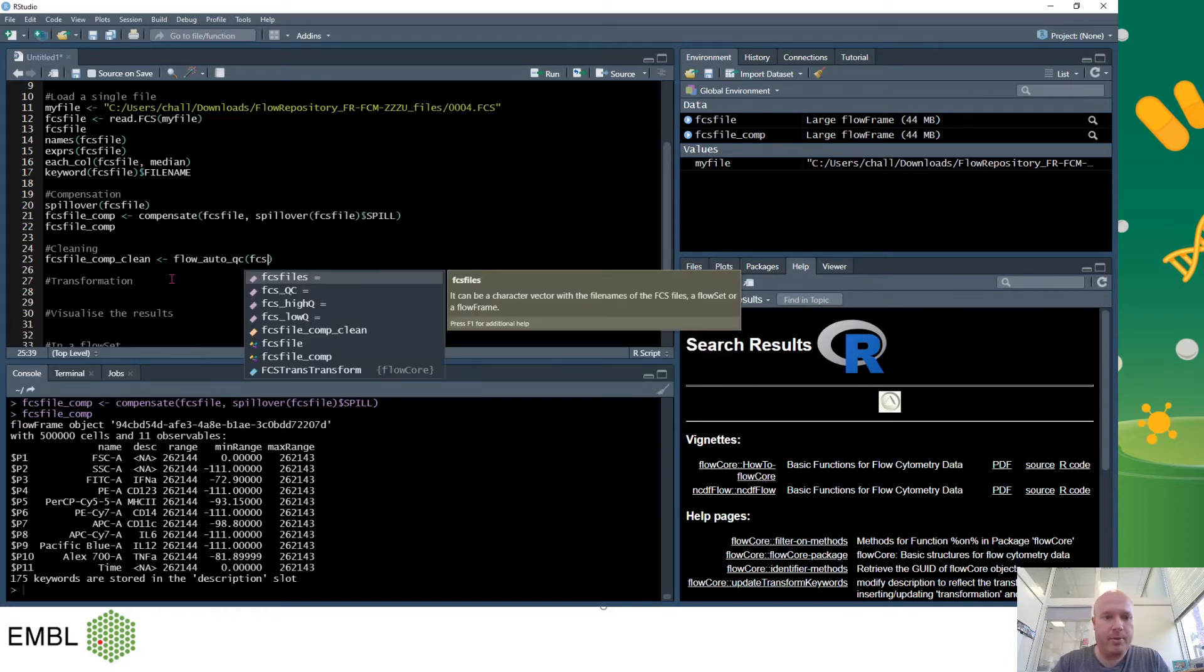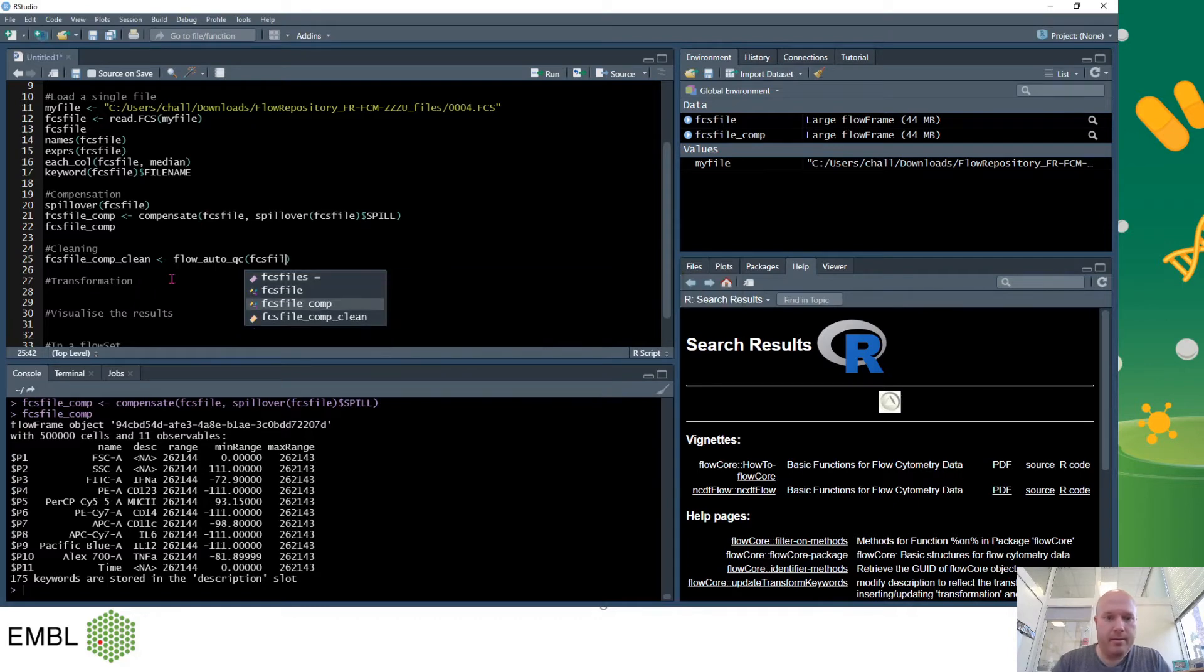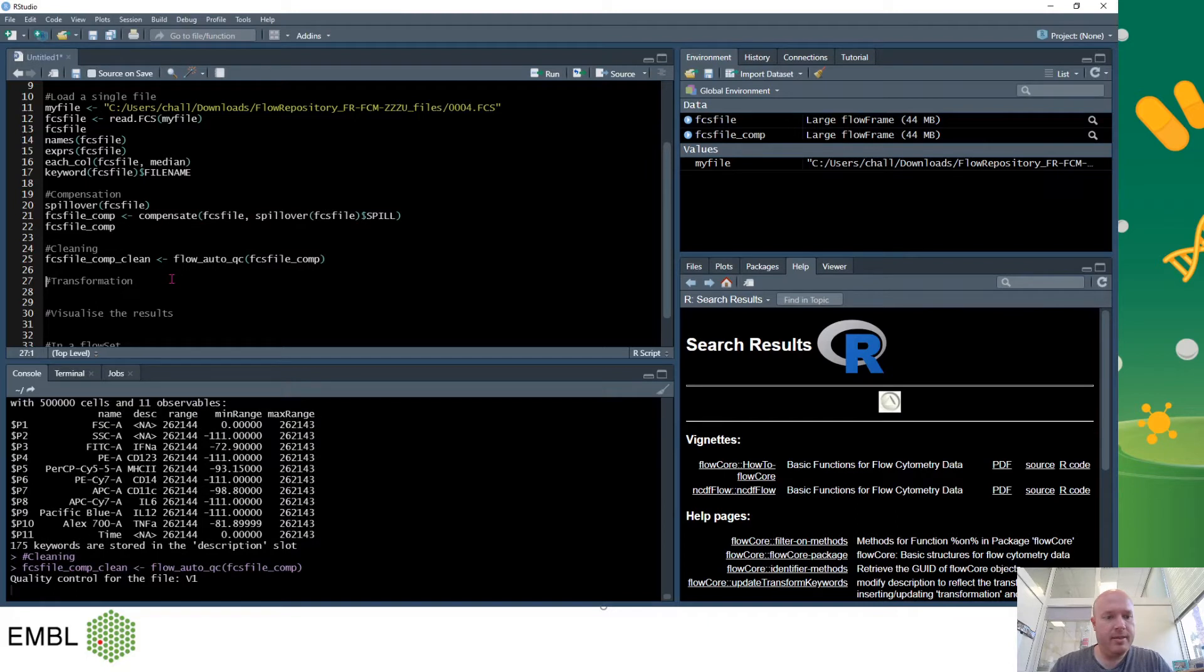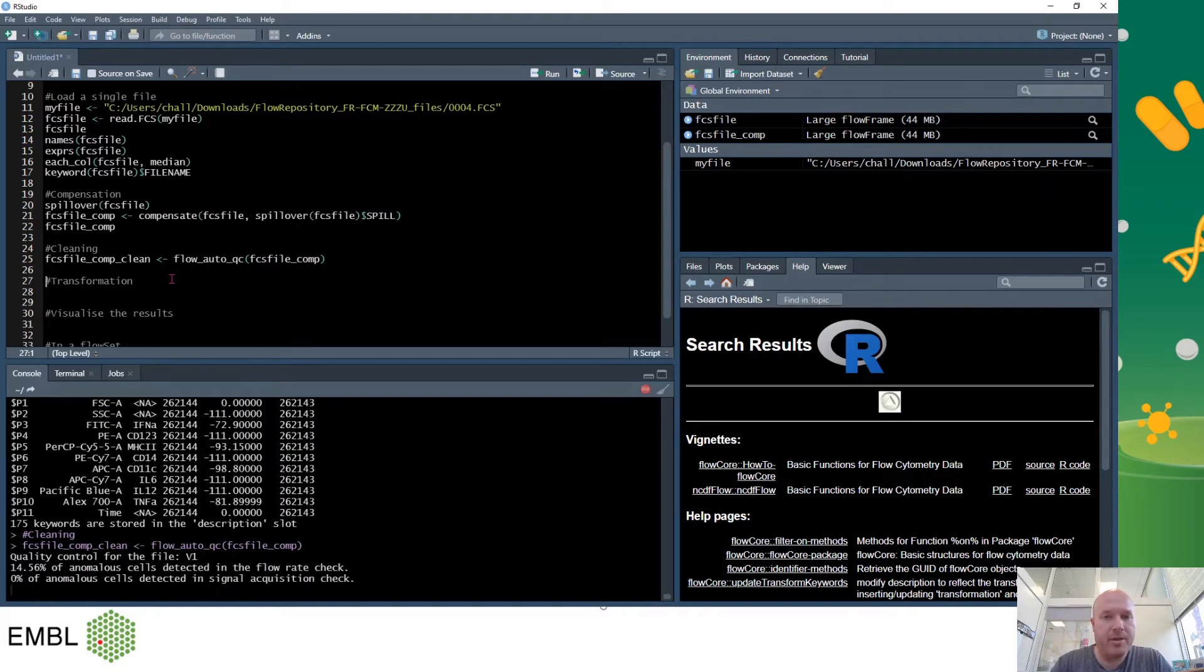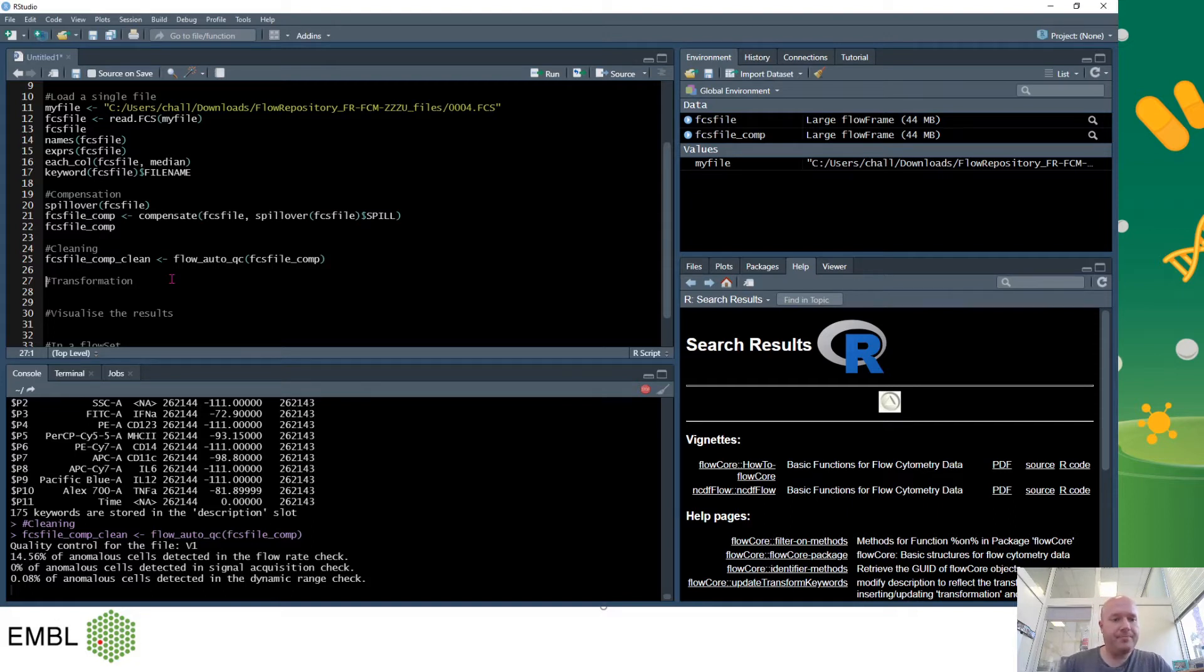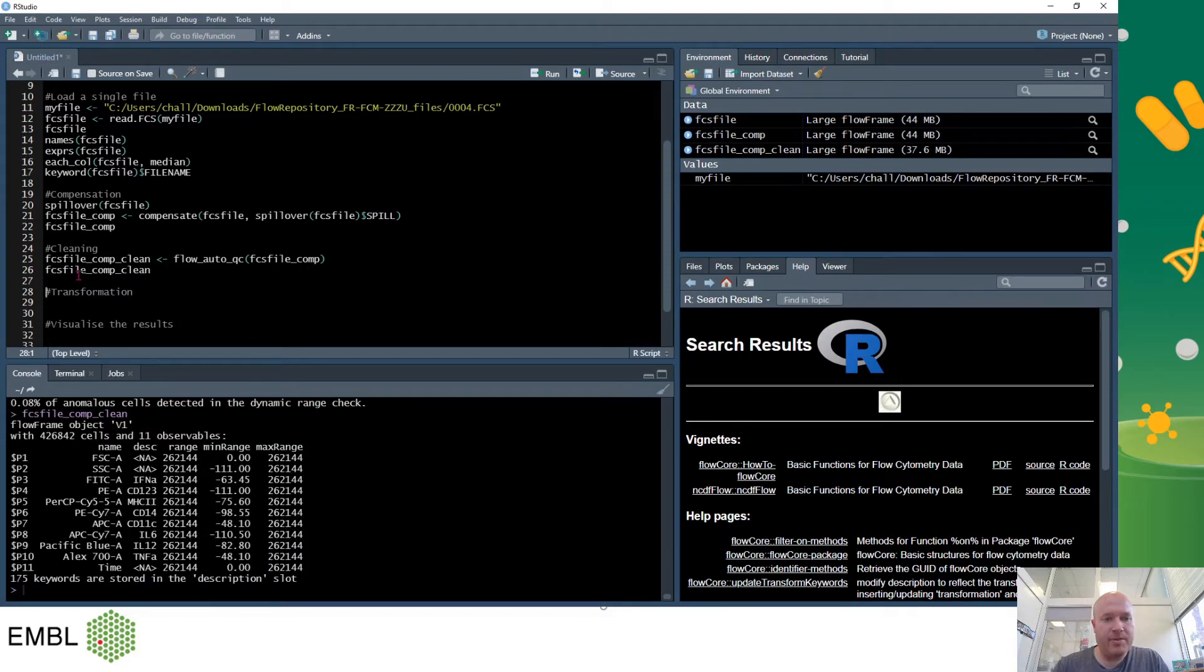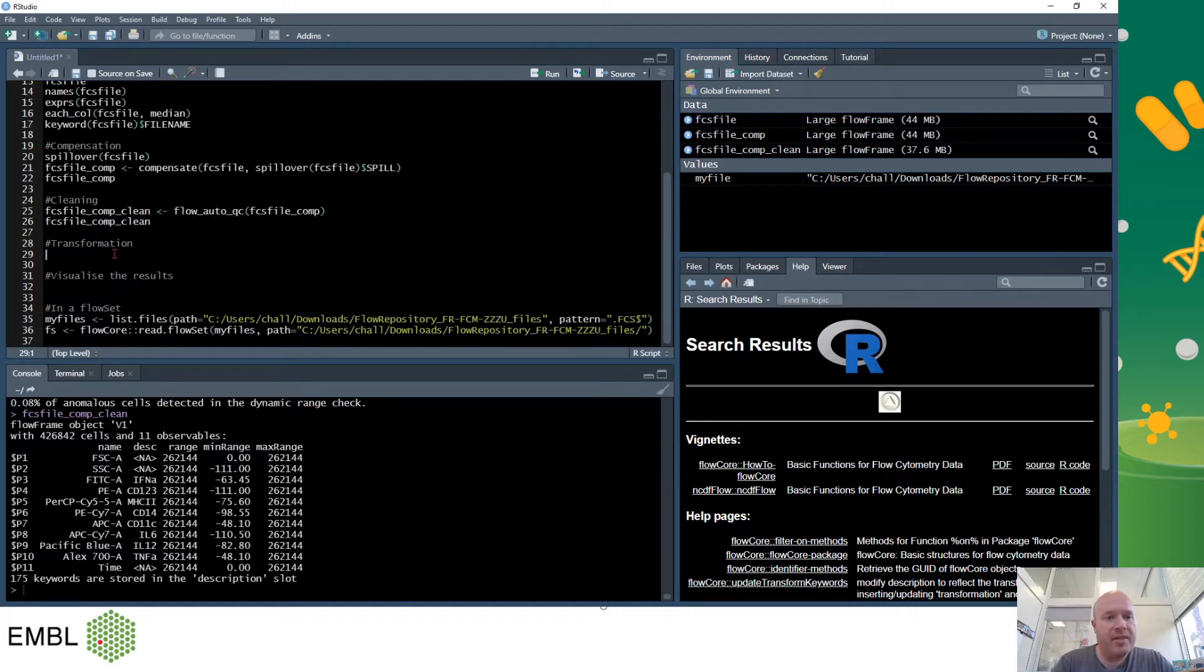And it wants me to input my file, press ctrl enter, and then it will automatically go through all the parameters. And what FlowAI does is it looks for changes in instrument speed, changes in signal intensity, and looks for cells that are outside the dynamic range. And this will create a new variable called FCS file comp clean. So now we don't have 50,000 events, we only have 42,842 events, because it's removed the events it classifies as bad and we'll visualize those events later on.